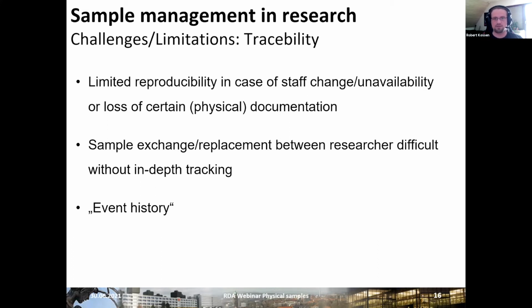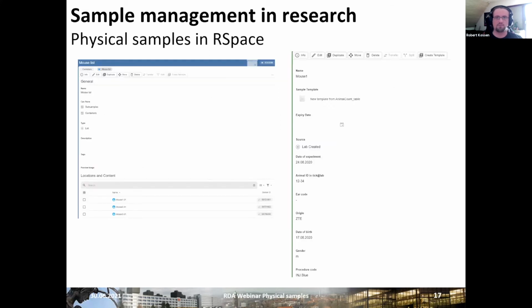And just as a teaser of what comes up next, because I talked so much about problems, these are not insurmountable problems. One very elegant solution that might at least alleviate some of them is a digital interaction, digital tracking of physical samples that directly works together with the day-to-day experimental notations and the electronic lab notebook, which helps to keep everything more organized, metadata and information more complete.